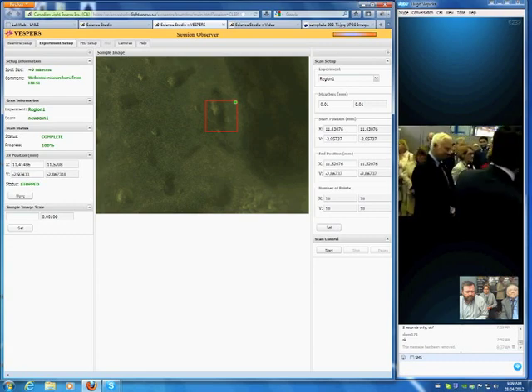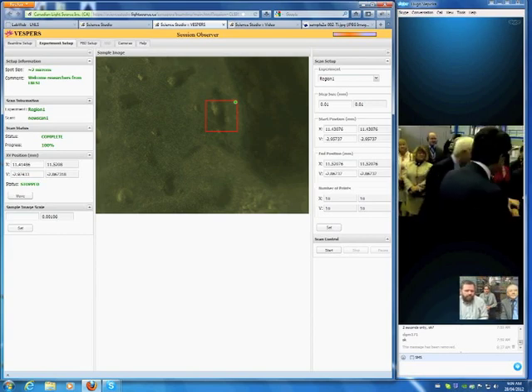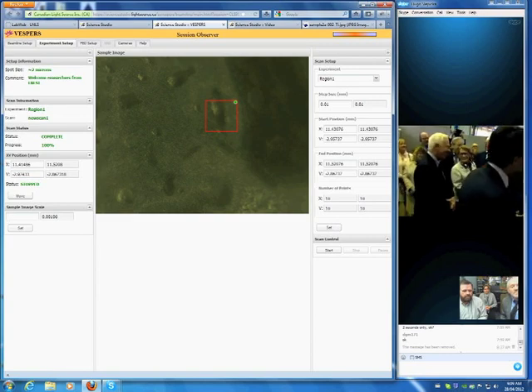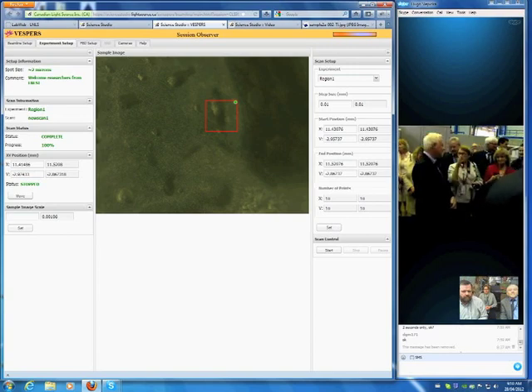So, we start our experiment. That's very important. And keep your focus. Here is the setup. What you're going to do is press start. And then you can write the name of your scan. You can put your name on it if you want, just without spaces. And enter.